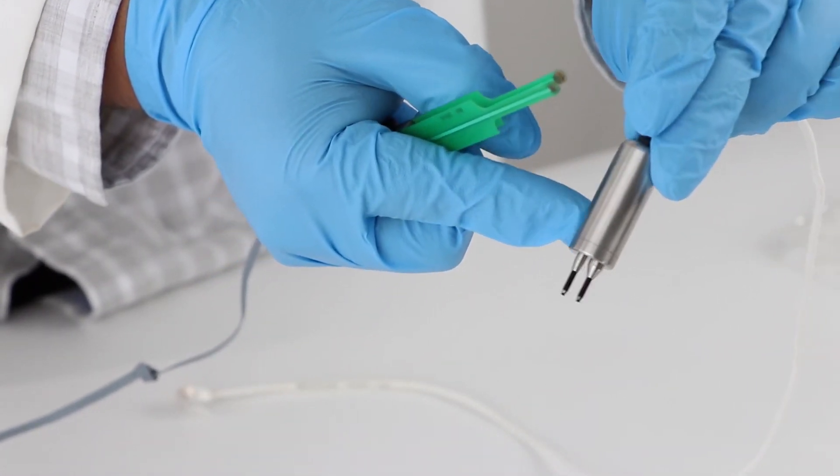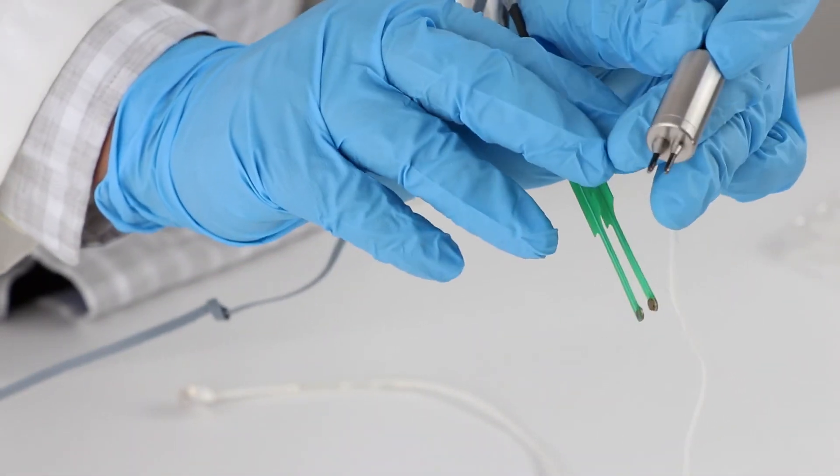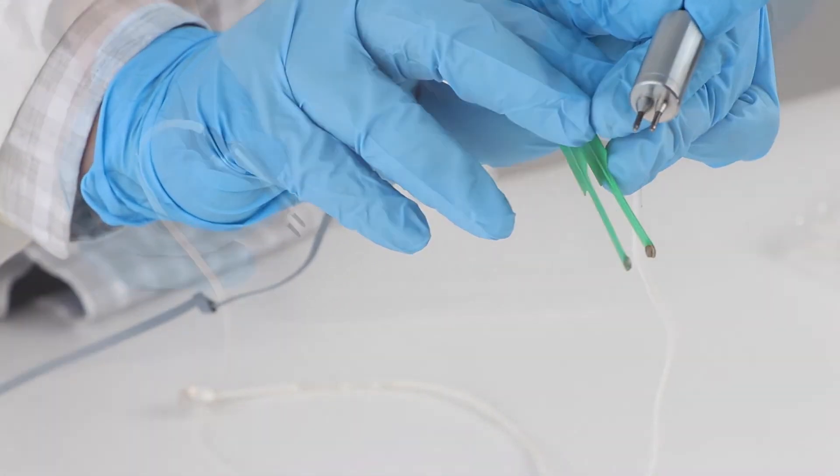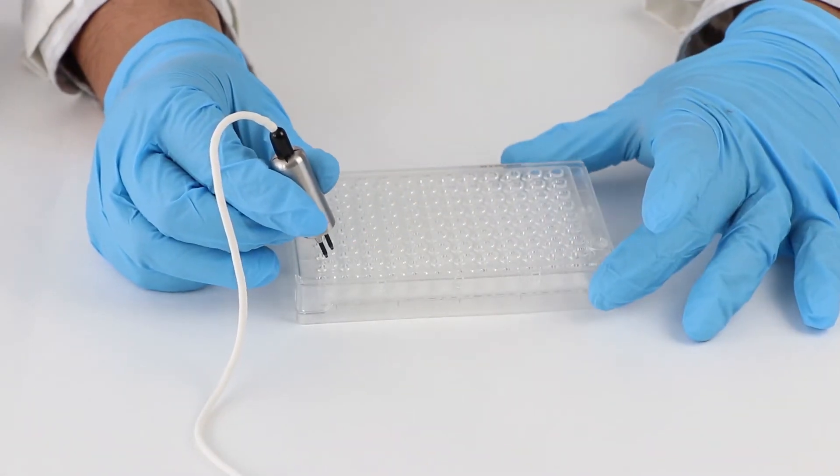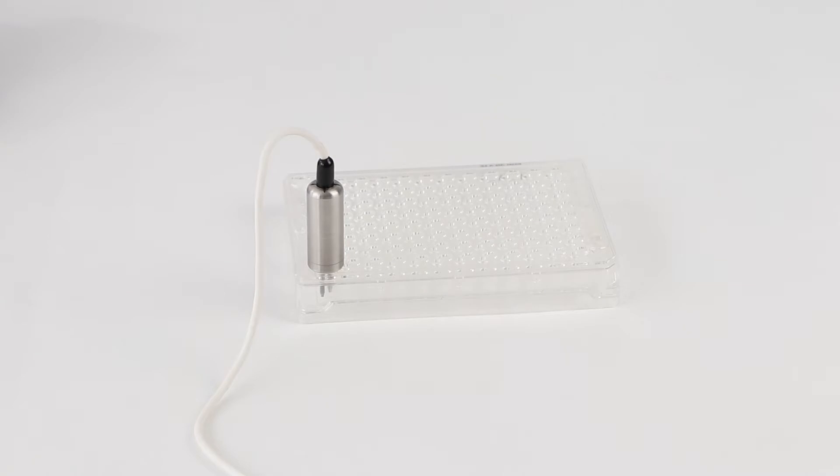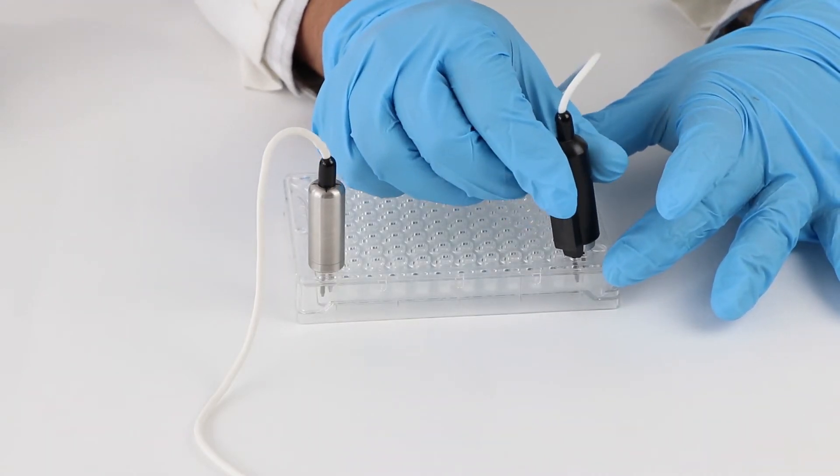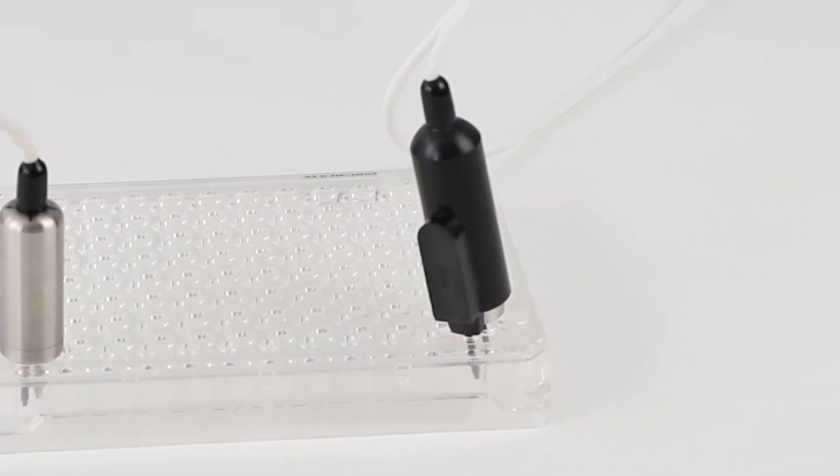These electrodes may only be used with specific well plates containing permeable membranes. The STX100 has several options which are compatible with specific cell culture plates. For example, the STX100M may be used with the Millipore 96 well plate. You cannot use an STX100F with this plate. Choose the electrode according to your requirements.